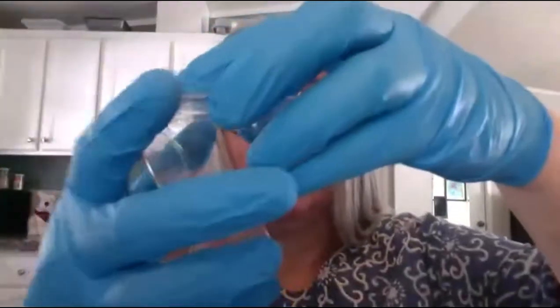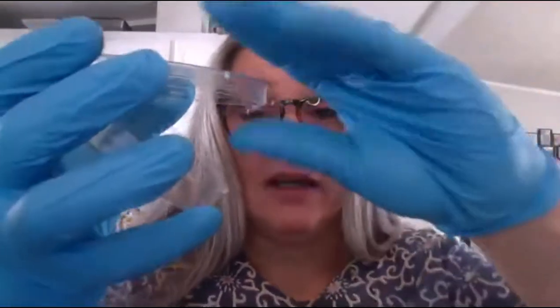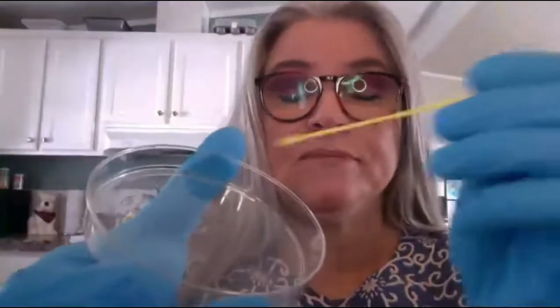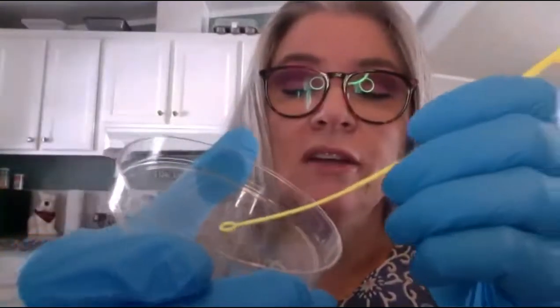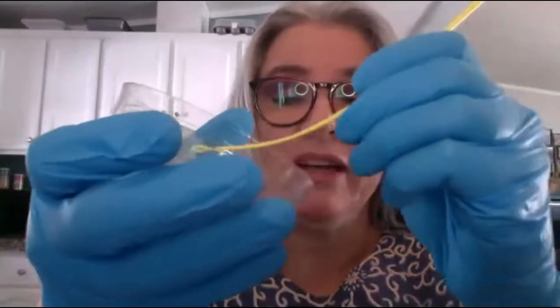Or, as I showed you in the video, you also have the option to add the lid like this if it makes you feel like you're getting more protection from contamination. But it's perfectly fine just to take the lid off and keep your dish at an angle. But I want you to see how soft agar is. If I push too hard on this agar, I'm just going to scrape it and ruin it.